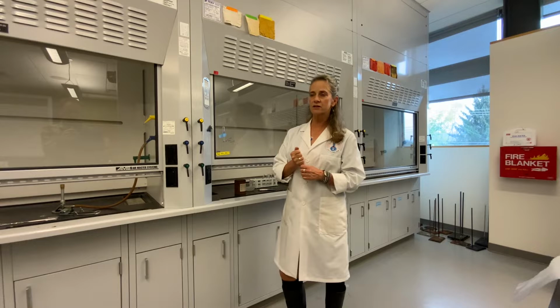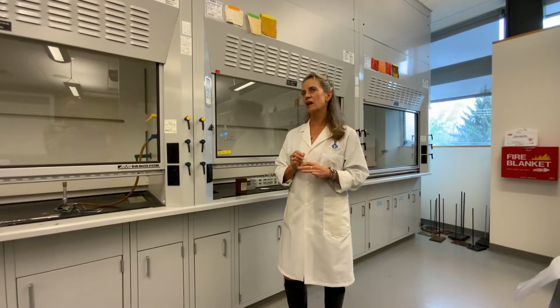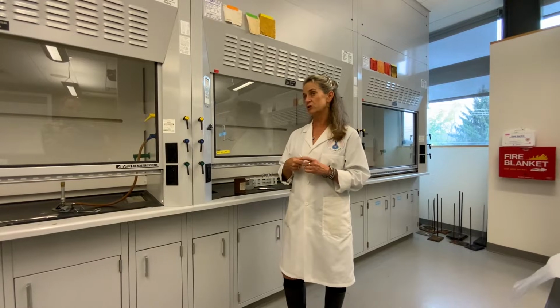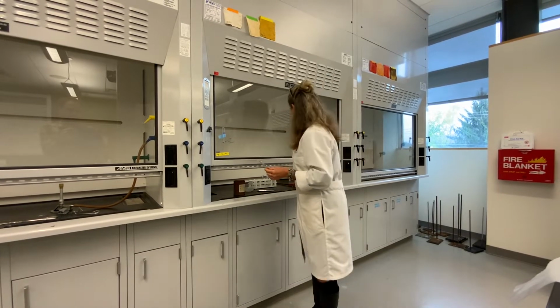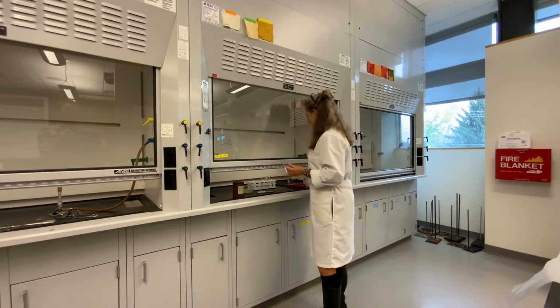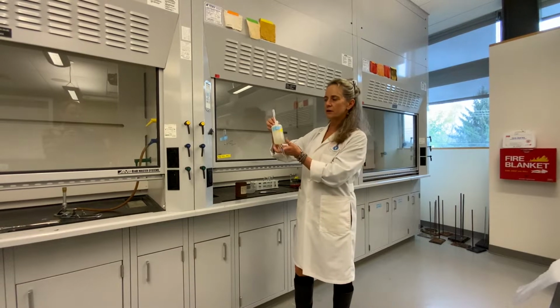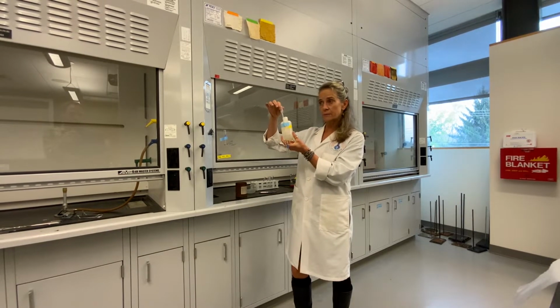This is a very exothermic reaction, meaning it's going to get hot. And I have burned my hand on this before because I forgot to put my test tube in a test tube holder. So don't forget to do that. So you're going to put it in a test tube holder, and you're going to add a milliliter, I think, of hydrochloric acid. And again, I'm going to encourage you guys to practice using the graduated pipette.